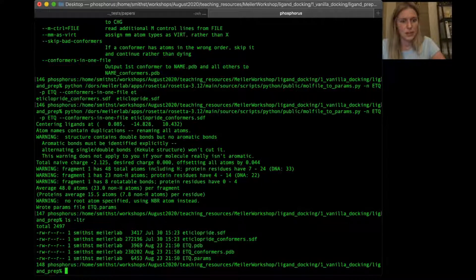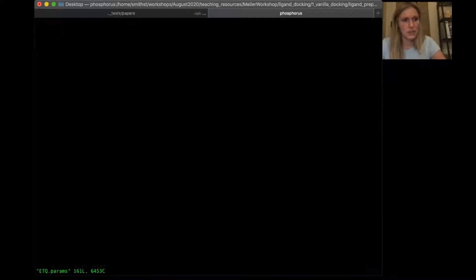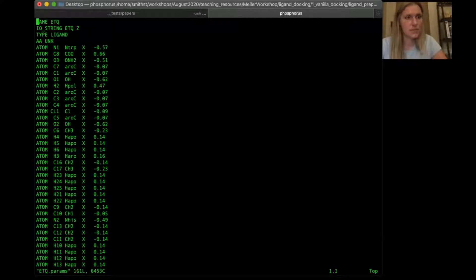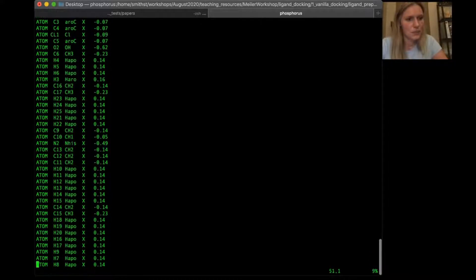The etq.pdb is simply the first conformer in the file converted to a PDB, and we converted all conformers from the SDF into PDB format. Let's look at the etq.params file — this tells Rosetta everything it needs to know about this residue: its name, what type it is (in this case a ligand), and then atom names similar to how a PDB is set up. It includes atom type, the chain it's on (chain X), and its partial charge — rough partial charges generated within the molfile_to_params script.